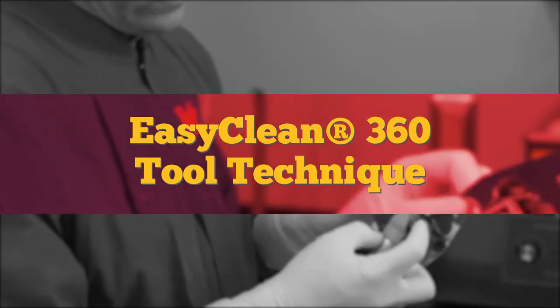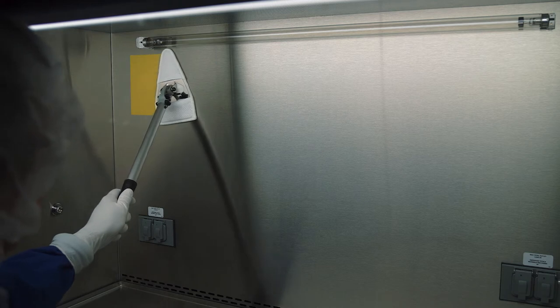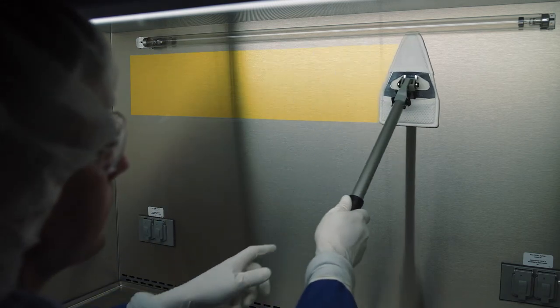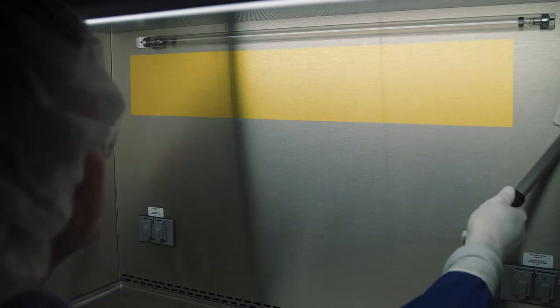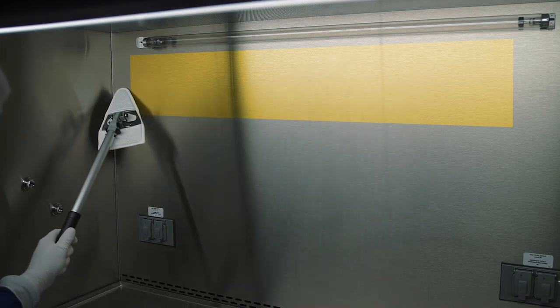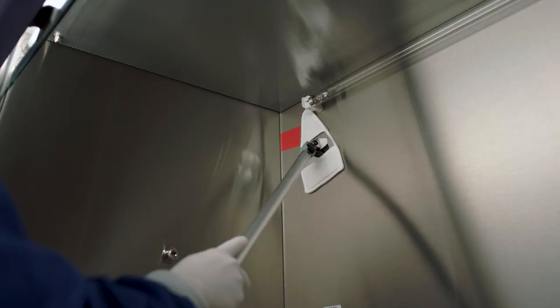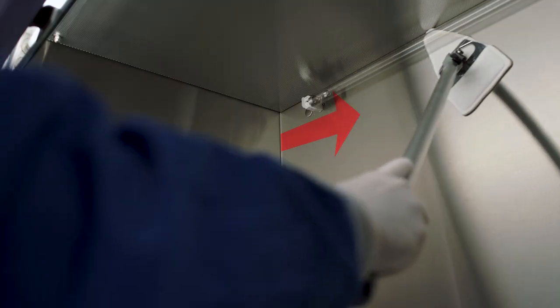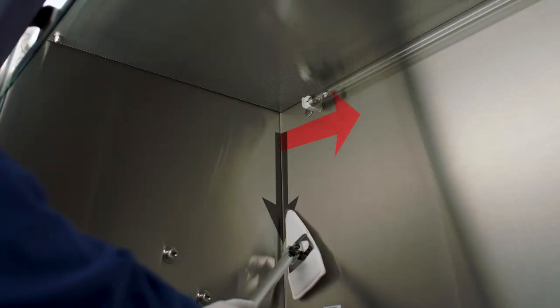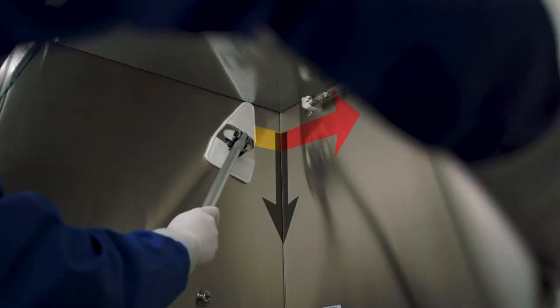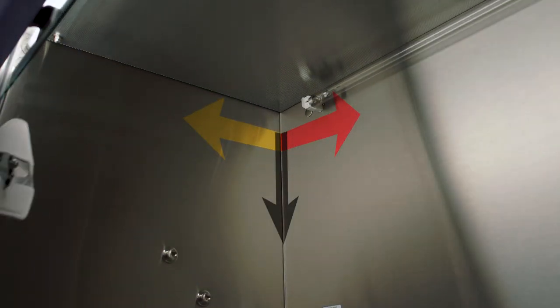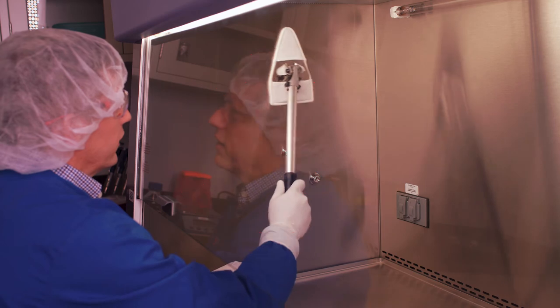EasyClean 360 tool technique: Wipe in straight parallel lines with overlapping strokes. Clean left to right, top to bottom, back to front, cleanest to dirtiest. Never wipe in a circular pattern.